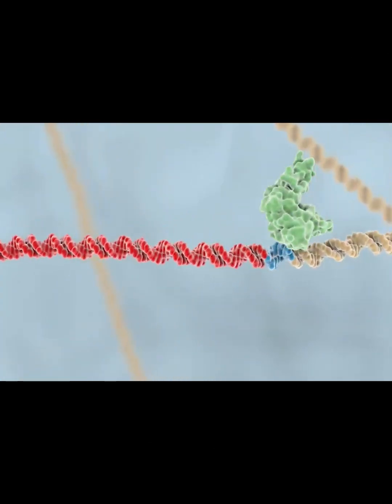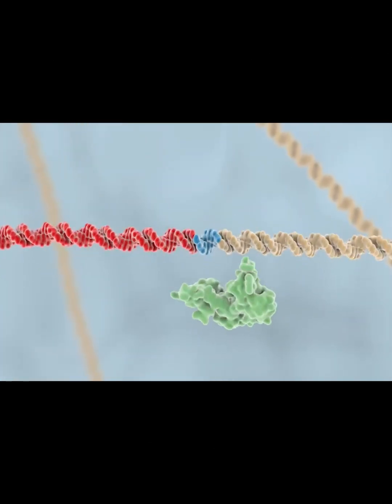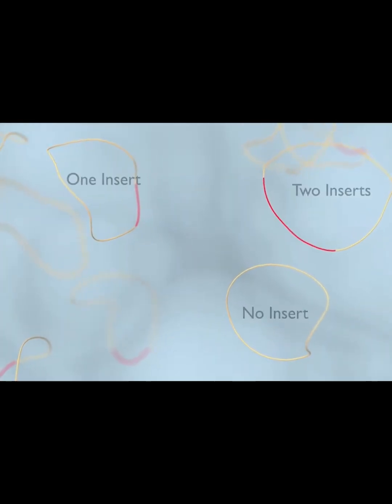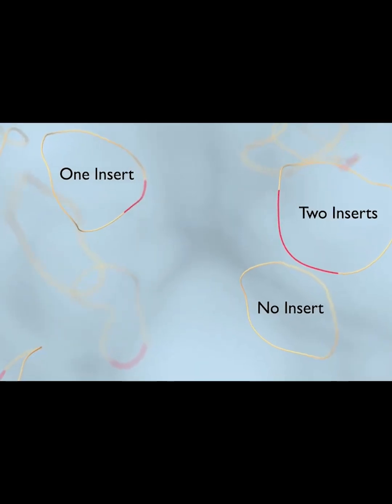Finally, we perform mini-prep, EcoRI digestion, and gel electrophoresis to confirm that our plasmid contains the 1.5 kilobase mutant insert alongside the 3.9 kilobase vector backbone.